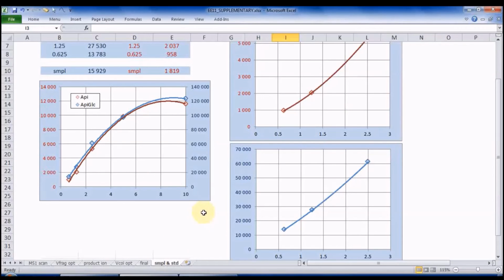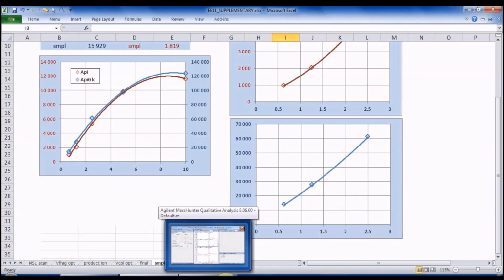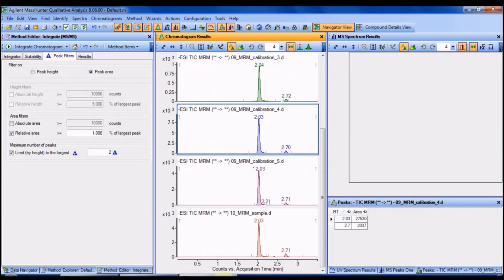Alternatively, if we are within the linearity range, we can use just a simple proportion, but with MS, since we usually do not have such clear linearity, it is preferred to use at least a calibration curve, if not the standard addition or internal standard method.